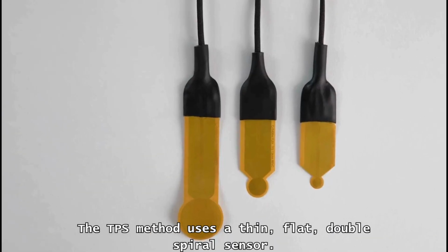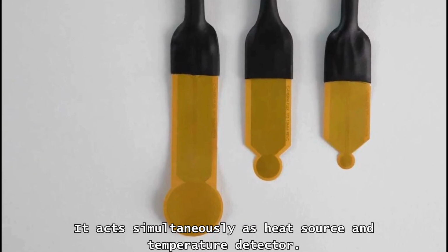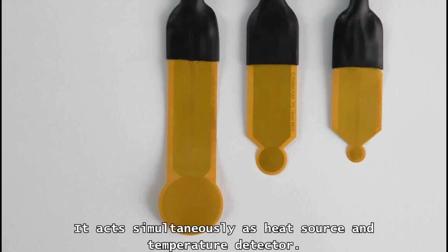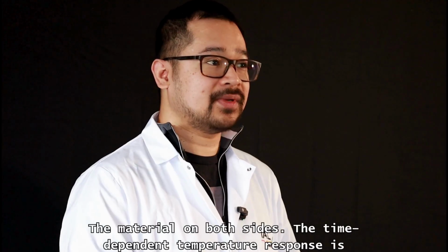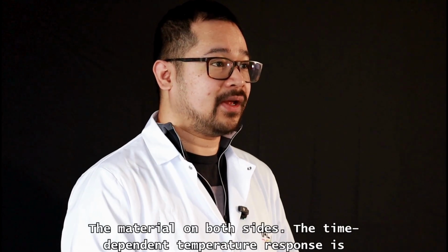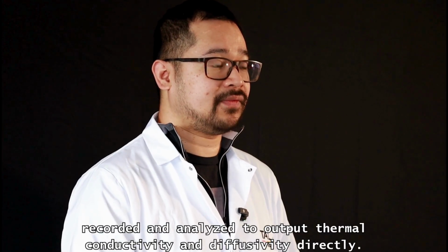The TPS method uses a thin, flat, double spiral sensor. It acts simultaneously as heat source and temperature detector. Electrical power is applied, and heat diffuses symmetrically outward into the material on both sides. The time-dependent temperature response is recorded and analyzed to output thermal conductivity and diffusivity directly.